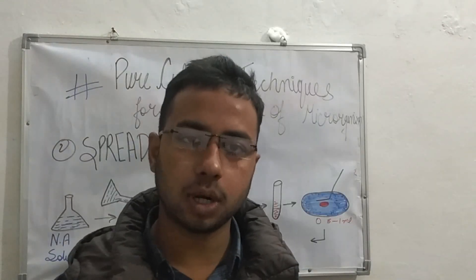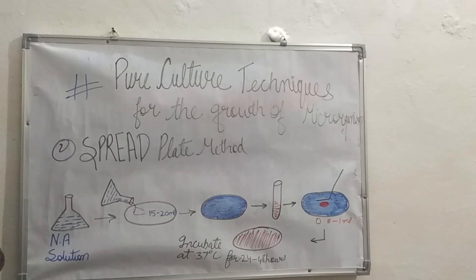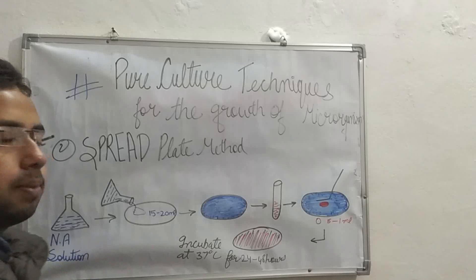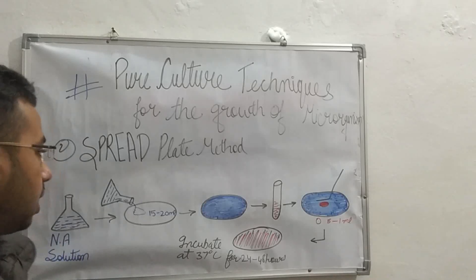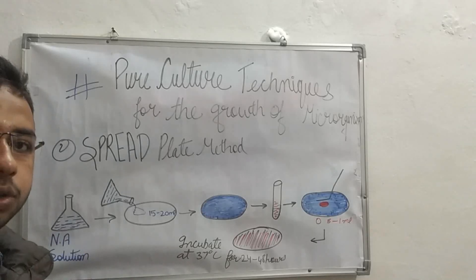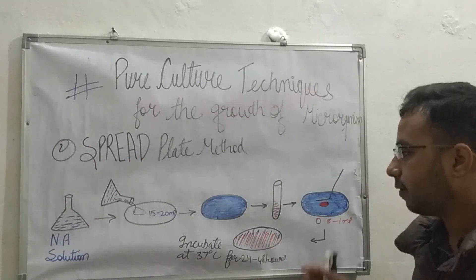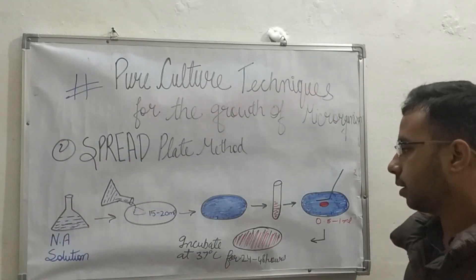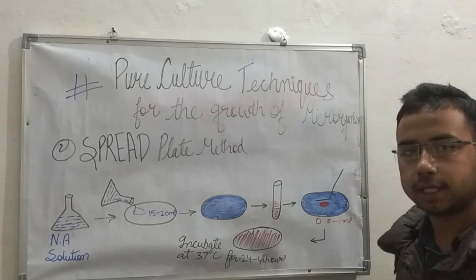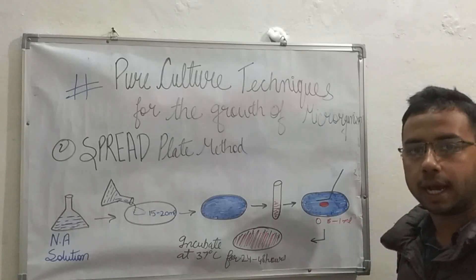For the spread plate method, we need nutrient agar solution autoclaved at 15 psi, 121 degrees Celsius for 15 minutes, and autoclaved petri plates. We pour 15 to 20 ml of nutrient agar solution onto the petri plate and leave it for solidification. After solidification, we inoculate some microbial culture which is 10-times diluted onto the solidified agar media.